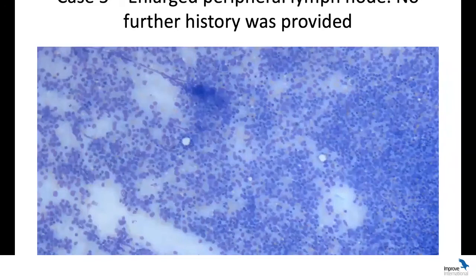So again, I've given a couple of tips on how to look for good quality smears for lymph nodes. And remember that I learned to do them with that cover slip, but I don't recommend people doing it like that. So when we have areas like this, where it's even cracked, this is again those areas that are too thick for us to look at.